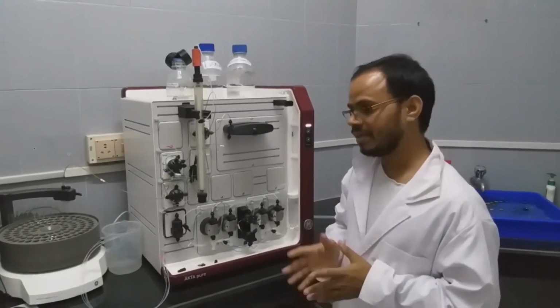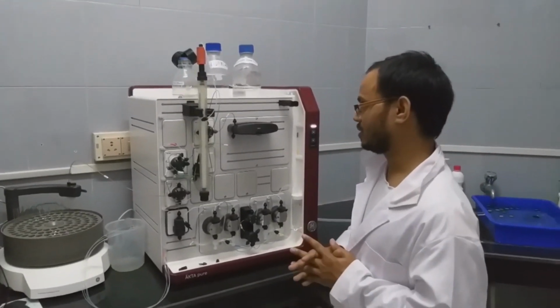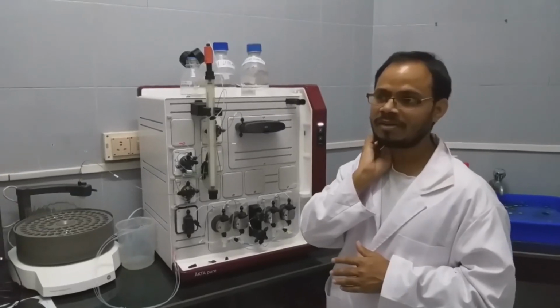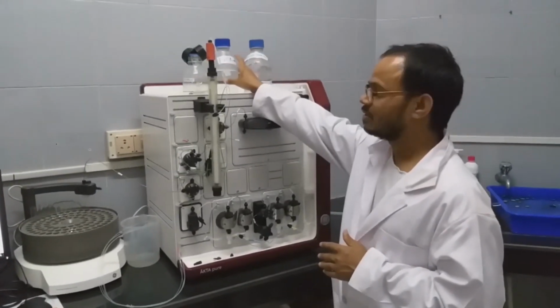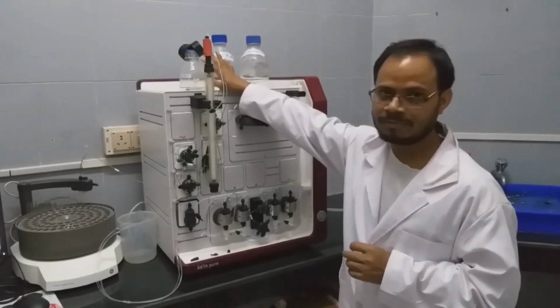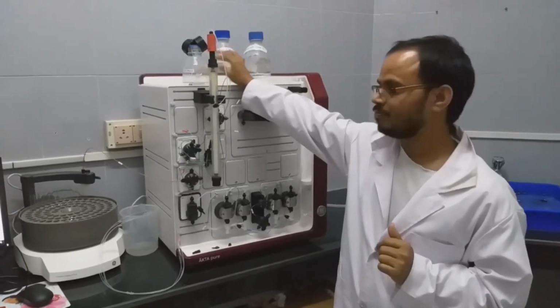So it will remove any air or air bubbles present in the buffers. It will remove those things. So we are using the most common buffer, that is phosphate buffer with pH 7.4, and this is the liquid water, and this is 20% ethanol. All the buffers were filtered through a 0.2 micron filter paper and also degassed.